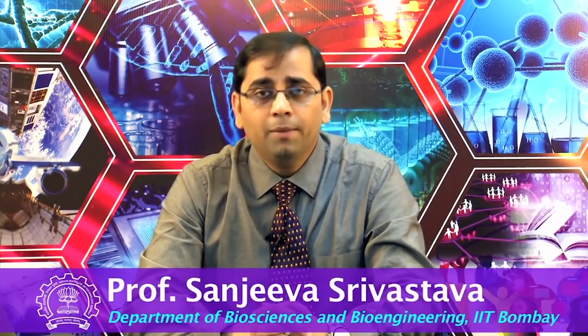Today we try to provide you interaction with one of the leading companies and their application scientists, who talk to you about MST technologies and also the quality control assays done using Tycho technology. I hope these provide you some insight about how to do your experiments for the proteins to further characterize them using the latest label free biosensors.